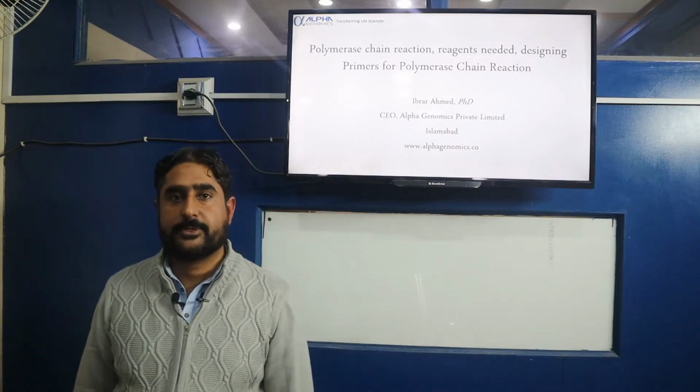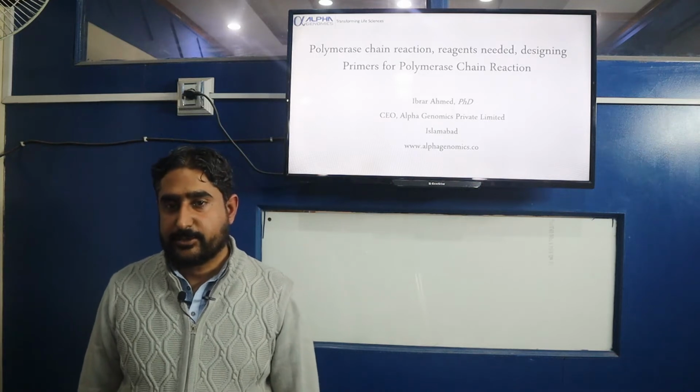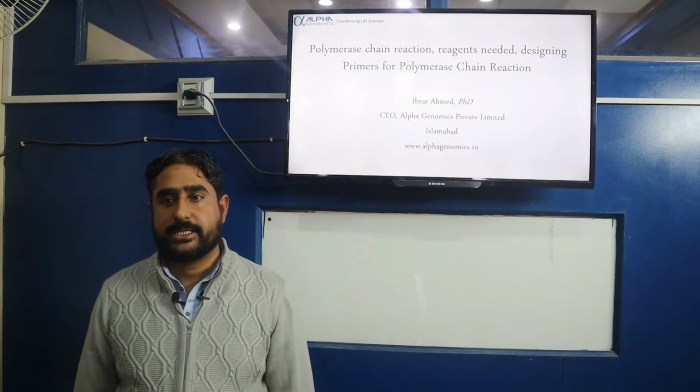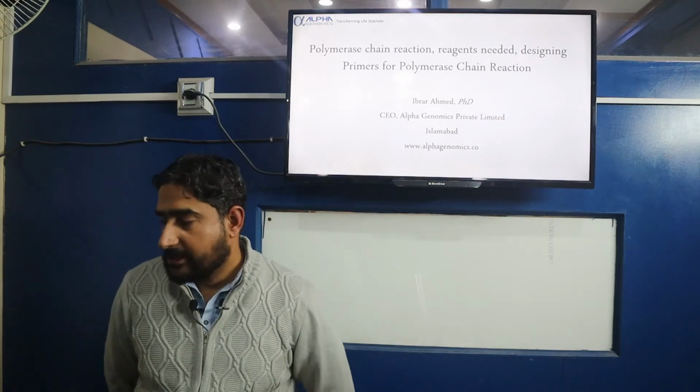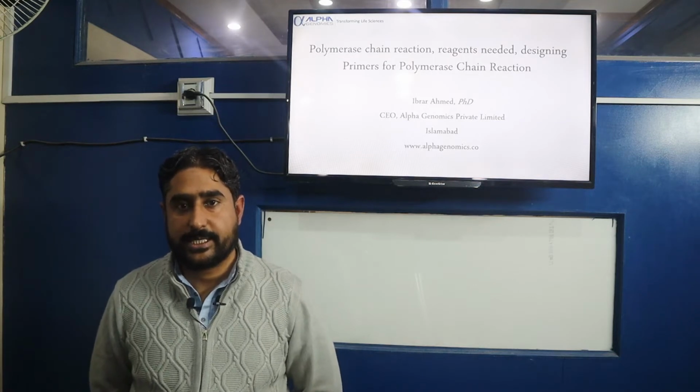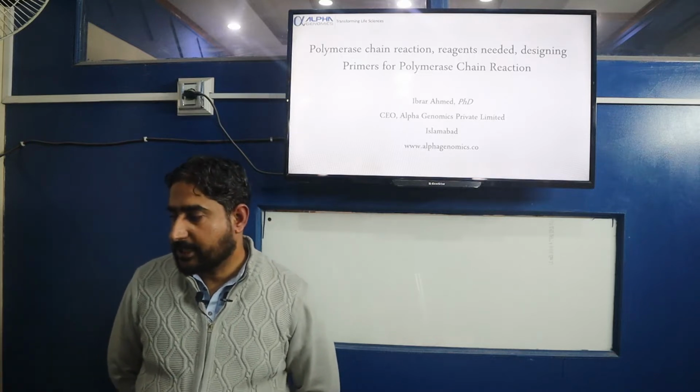We are going to discuss primer designing and the use of primers in PCRs. So what is PCR, what are the reagents needed for PCR, and specifically talking about the primers, the role of primers in PCR and designing the primers for a PCR reaction. We'll talk about this.